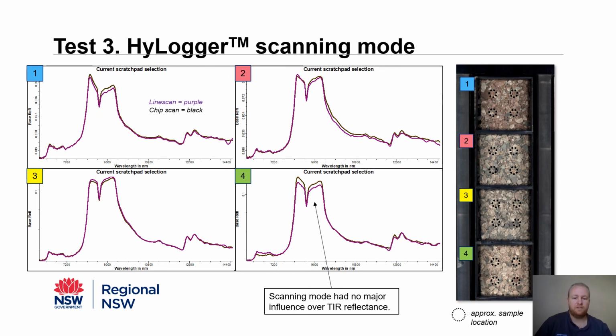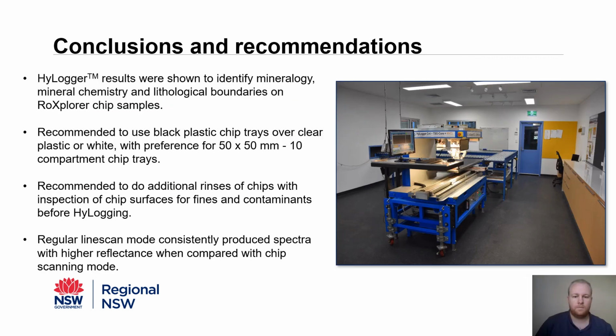For the thermal infrared, there was no discernible difference between the positions of absorption features or total reflectance between the 2 scanning modes, as shown here in the 4 examples.